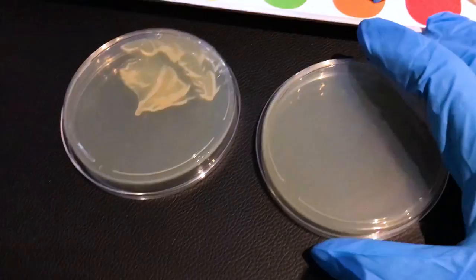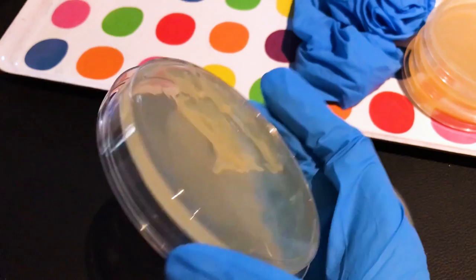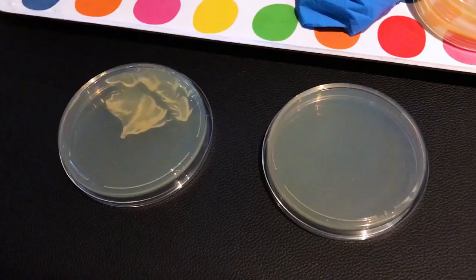So two things happened when we were preparing our samples. The first one, we rushed it — it was too hot when we put it in, and we ended up with a whole lot of condensation on there. The second one we forgot about, and it ended up congealing and got very lumpy. Regardless, it looked good enough for our experiment, so we carried on.